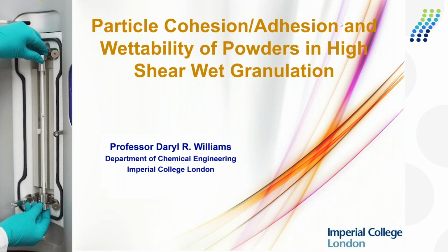I hope you can all hear me, and welcome to this afternoon's presentation. Today I'll be talking to you about particle cohesion and adhesion and the wettability of powders, and this is going to be spoken about in the context of high shear wet granulation. I'll explain quite soon a bit about high shear wet granulation. It's an important processing operation. So we're going to be talking about powders, powder surface properties, and how they relate to the performance when you start to granulate powders.